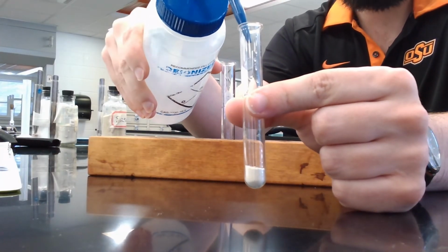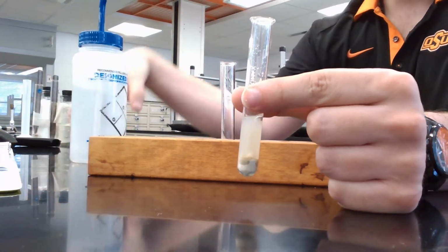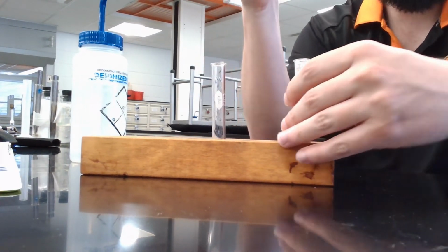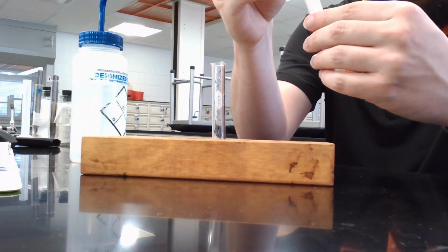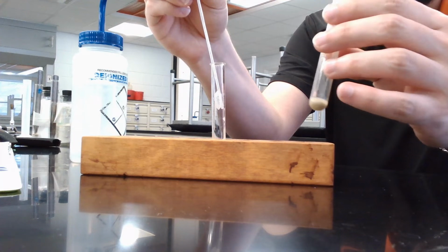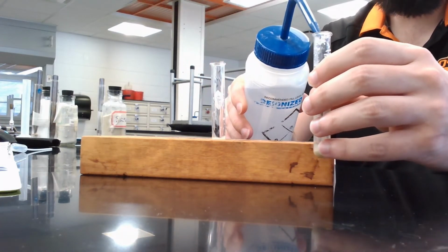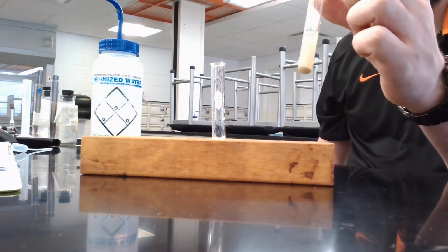I'm going to go ahead, add water to my unknown mixture to begin separating the 3 components. So now, while the silt is still suspended, I can quickly pipette off the water layer, being careful to leave the sand behind at the very bottom of this. Go ahead and rinse this a couple more times at least. As you can see, there's still quite a bit of silt suspended in here.